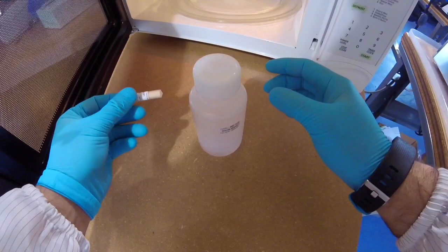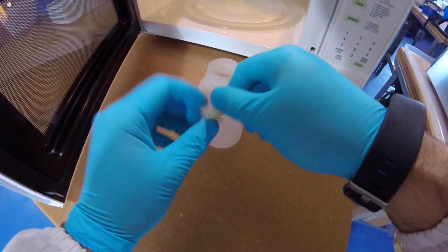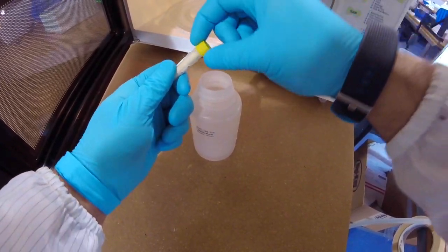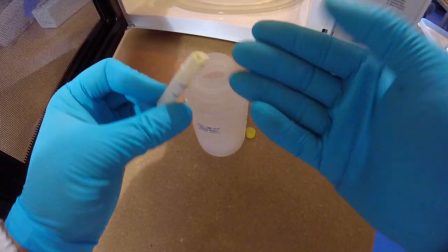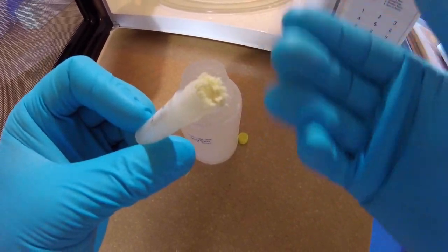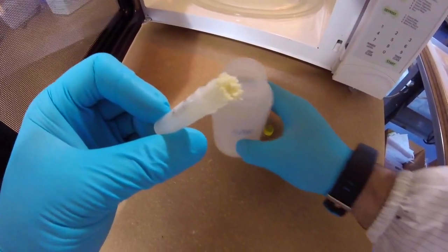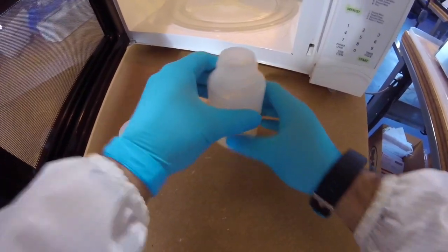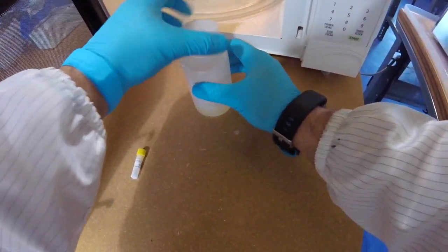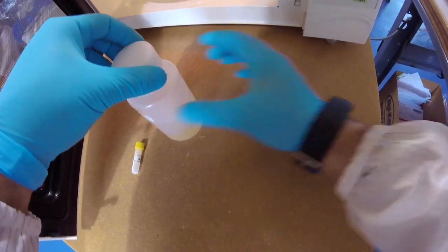We're going to get the agar powder and remove the lid, so there is going to be vapor coming out. You kind of need to pour a little bit fast and give it some taps, and you will get some agar stuck to the edges around the rim here, simply because of the vapor when you pour it in. I'm going to put the lid slightly back on, just a little bit, and again it's hot, so you want to swirl it to mix in.